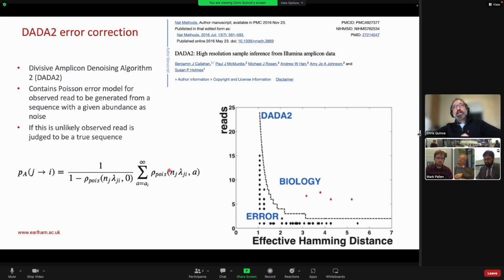So yeah, this is actually why I didn't adapt AmpliconNoise to my seq data. My algorithm was iterative. DADA was much faster because it's sort of a bit like that partitioning algorithm. It only has to pass through the data set once.